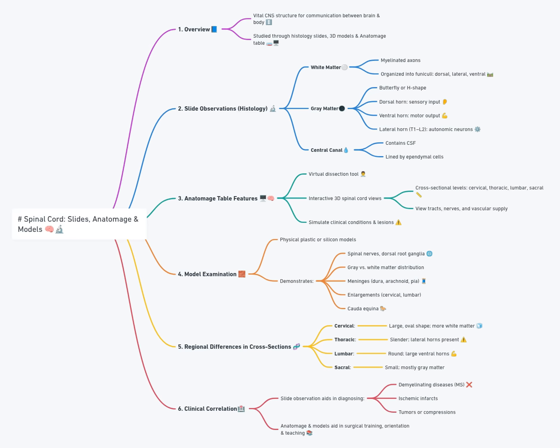sacral, and coccygeal regions. As you zoom in on the cervical region, note the cervical enlargement. This is more prominent due to the increased number of motor neurons innervating the upper limbs. Similarly, in the lower lumbar region, you'll identify the lumbar enlargement, related to lower limb innervation.